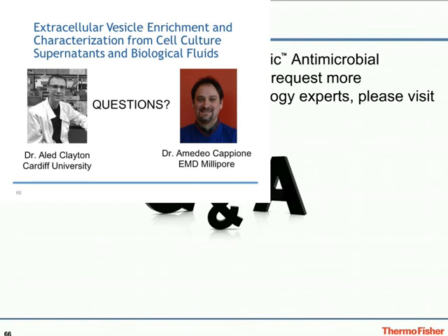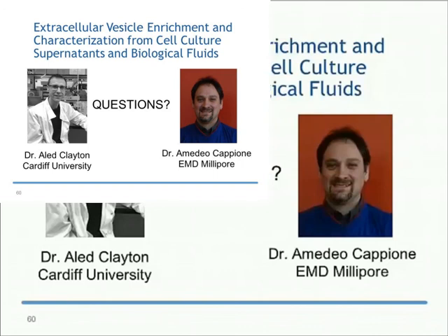No, I think Dr. Clayton covered it very well. There's a lot of issues associated with working with serum, with switching over what would be a standard cell culture method into a serum-free method. Most obvious being the perturbations of the cell itself due to this change. When I was developing our method, I focused on making sure that my cells were greater than 90% viable at the time of harvest to diminish the amount of cell debris due to apoptosis that would potentially interfere with what I was doing.